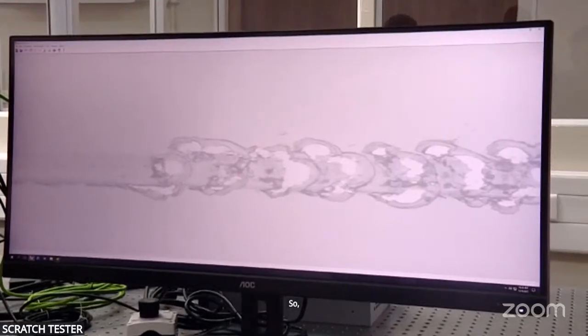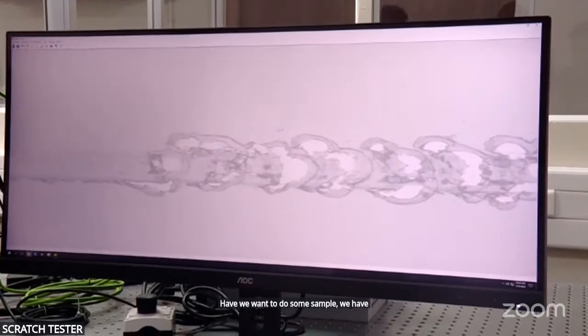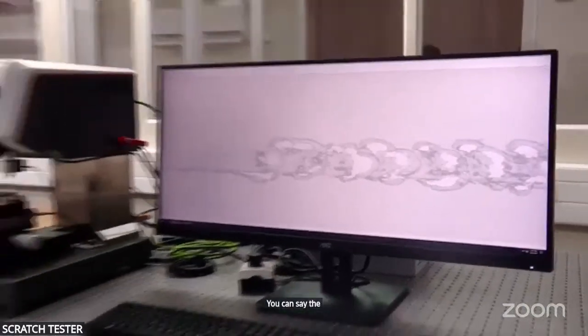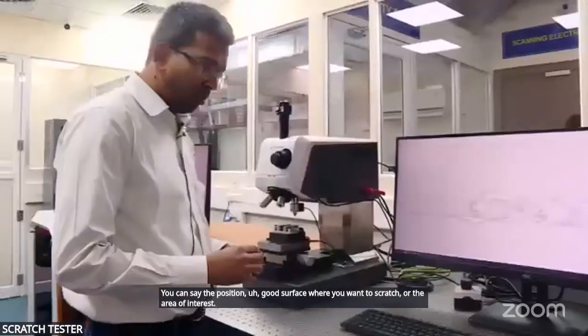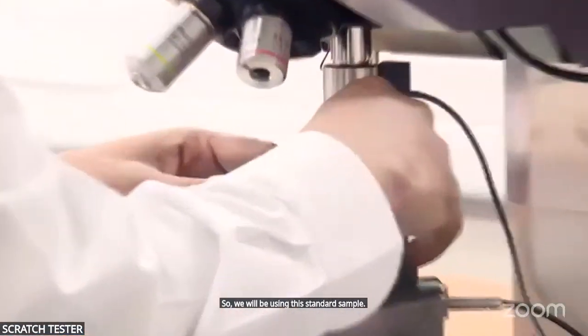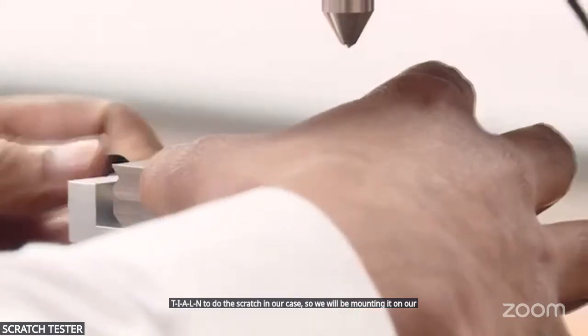First of all, if we want to test a sample, we have to find this position, or you can say the good surface where you want to scratch, or the area of interest. We will be using this standard sample, TiAlN, to do the scratch in our case. So we will be mounting it on our sample stage.